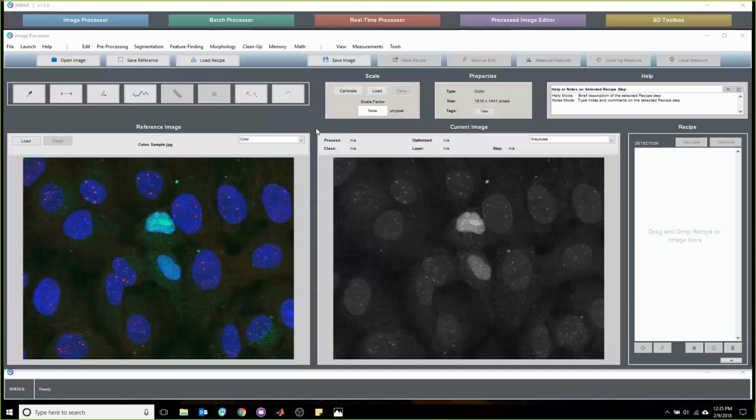So today I wanted to get into colocalization, something that is growing more and more in life sciences. The techniques that I'm going to be demonstrating here can also be applied to SEM EDX images, where you have taken images of some particles and recorded data of their properties in different channels. But for this life sciences application, what we were going to do is take a look at the problem that a customer had come to us with and see how we would have solved it inside of MIPAR.